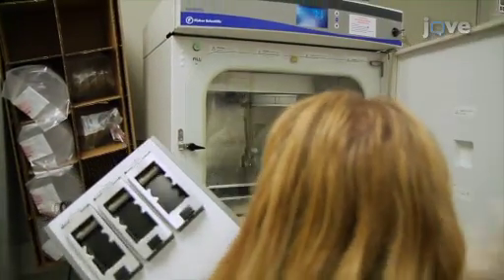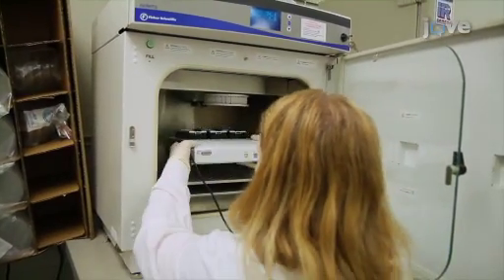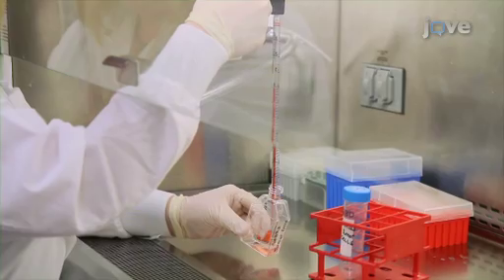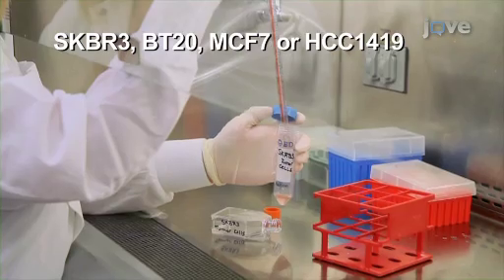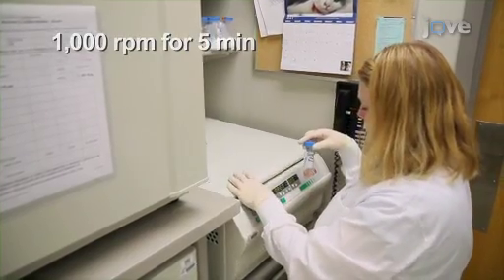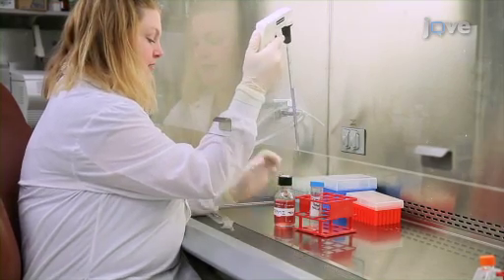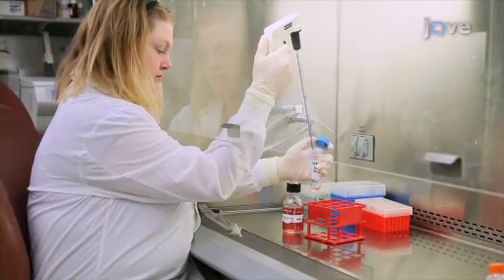Prepare the Excelligence impedance measuring station for use by equilibrating it to 37 degrees Celsius under 5% carbon dioxide for at least an hour. Harvest 75% confluent human tumor cells using 0.25% trypsin and centrifugation. Count the tumor cells using a hemocytometer and reconstitute them in RPMI tumor media at a concentration of 7,500 cells per microliter.